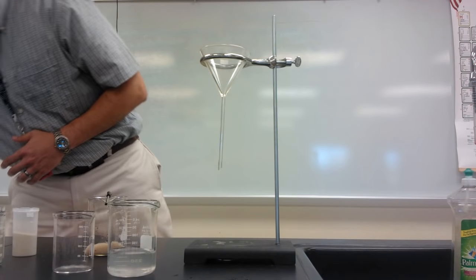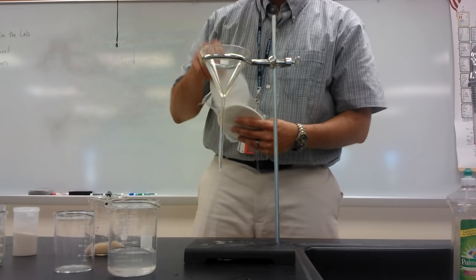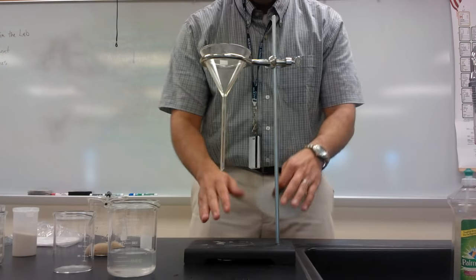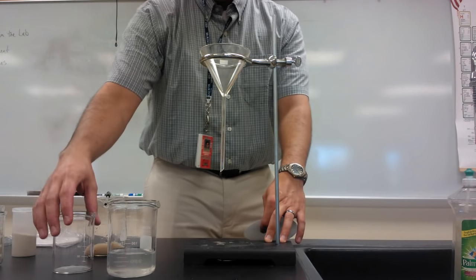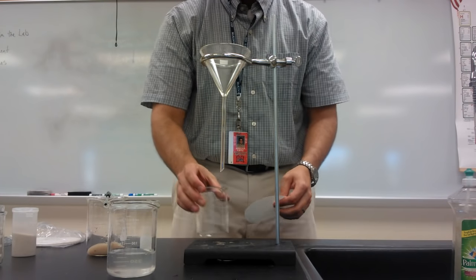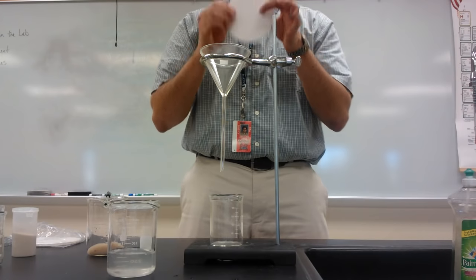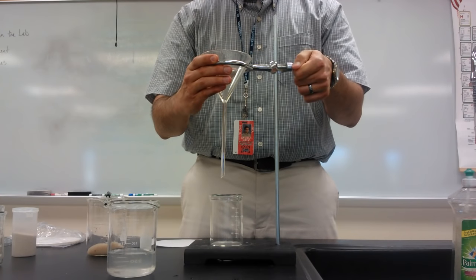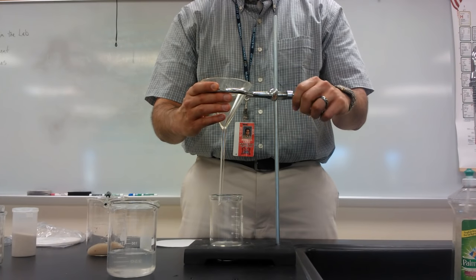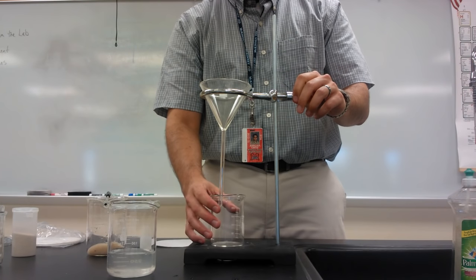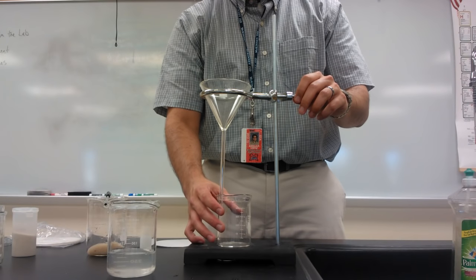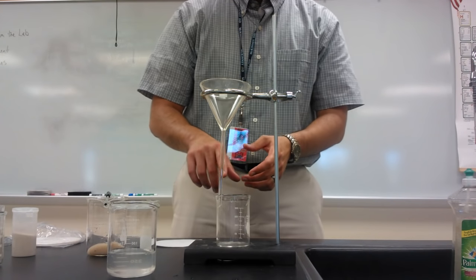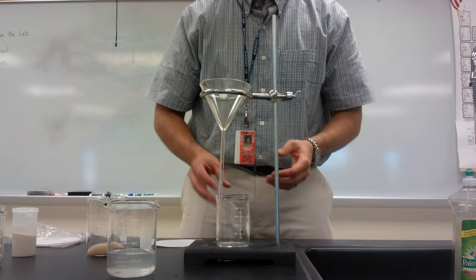To filter, we're going to be using a setup that uses some filter paper. We've got our funnel right here — a glass funnel. Notice that I've got my ring stand with my ring hooked up to it. I have a beaker that I'm going to hold my liquid in, and I've got a filter paper. The first thing I'm going to do is adjust my setup — I'm going to bring down my ring so that the funnel is just slightly in the beaker, and then place the beaker so that the funnel is touching the wall of the beaker. What I want is for the liquid that begins to drip down to run down the wall of the beaker — I don't want it to splash.